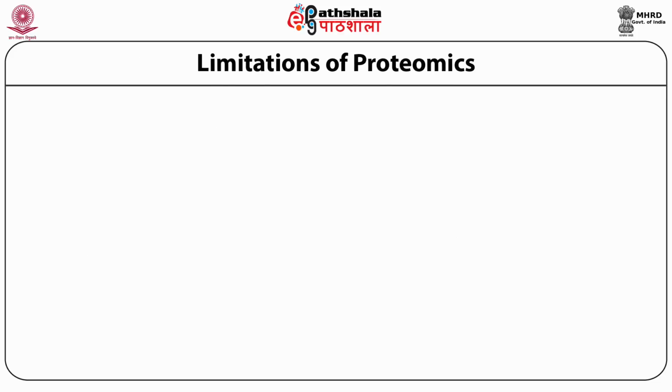Although there are so many advantages of proteomics, this technology also has some limitations. The limitations are that the solubility of individual proteins differs, and because of this you will find different reproducibility problems associated with 2D gels or 2D experiments.